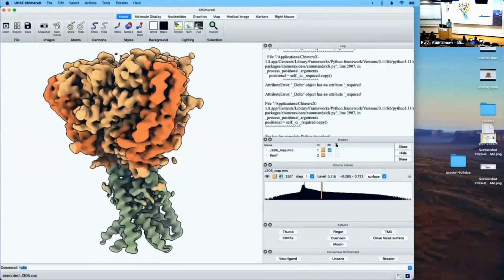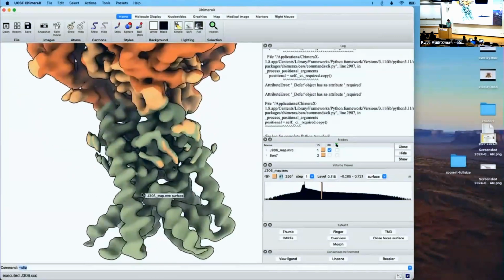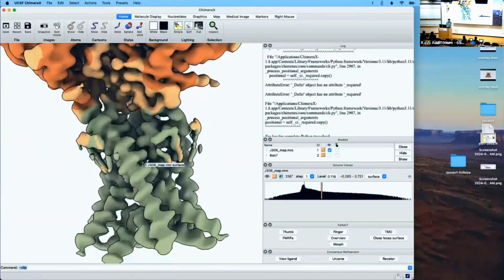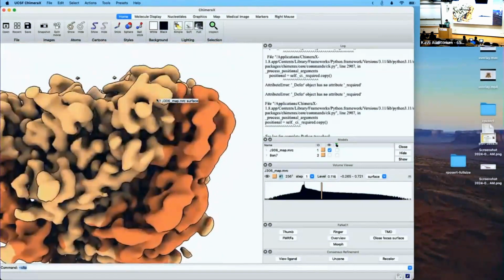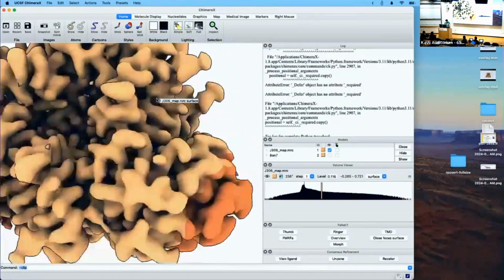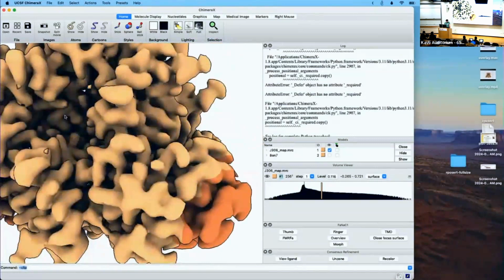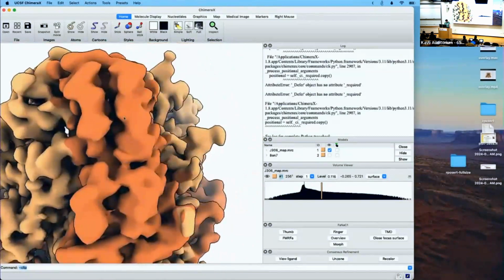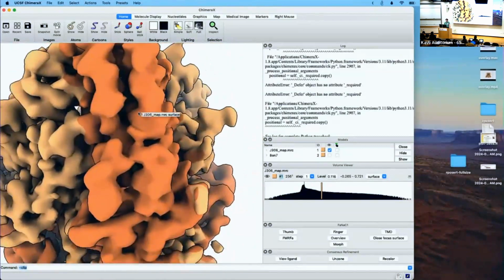And you can see it's a really gorgeous map, right? We can see maybe some lipids here or some detergents, who knows. The transmembrane helices look really good, and the handedness is right. Up here, the finger looks pretty good. It's a little blurry there, but back in here, you can see a lot of nice side chain density and things. However, the thumb is much, much blurrier, right? We have a pretty low quality map on the thumb.